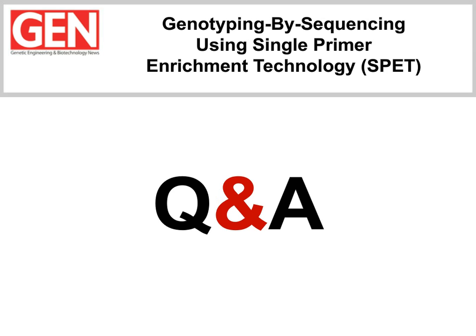And Luke, what is the limitation of the target region capture size? To date, we've not yet found a limit to the target region. We've worked on a number of custom designs extending to thousands of genes and tens of megabases in target space. And we expect that this can actually be expanded even further, given the specific need of a researcher for a large target region.